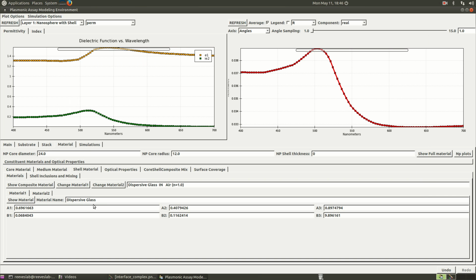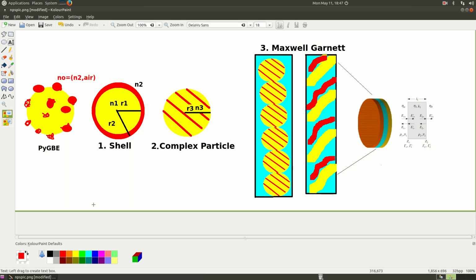For material 1, it's a good question: how do you model a protein as a sphere? Well, you can look at the index of refraction for some proteins, but that information isn't always available. When we were studying an albumin protein, we found that for the most part the protein was about 5 nanometers in diameter, but it was actually closer in shape to a triangle. We did build a shell filling model for triangular inclusions, but because we're using such a coarse grain model, it's not really going to make a huge difference with the shape of these. It's more about the fill fraction and the index of refraction that you use.